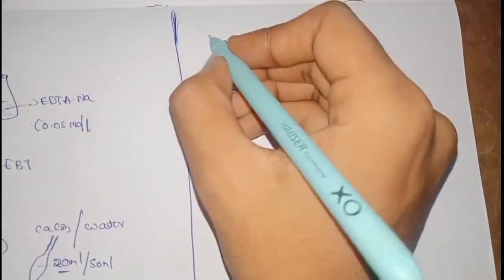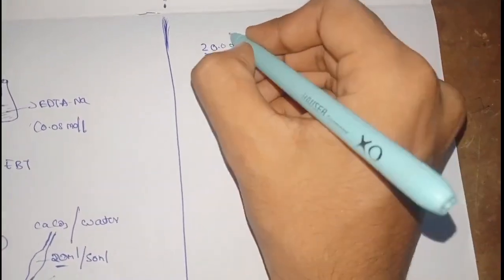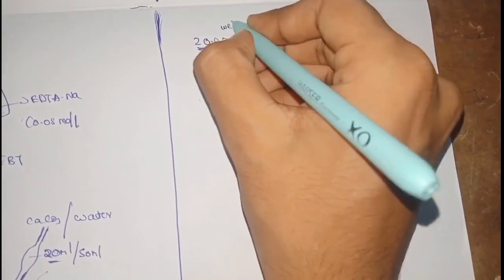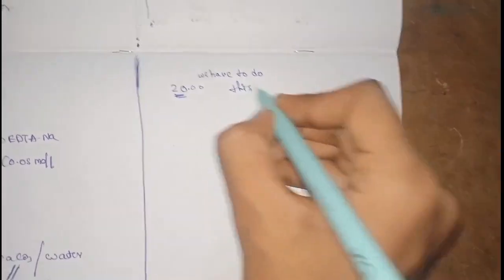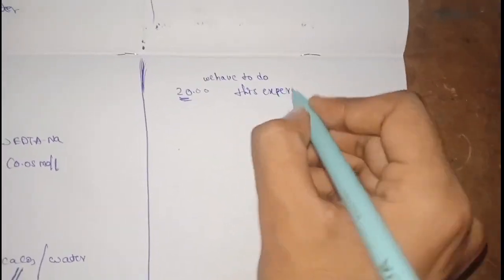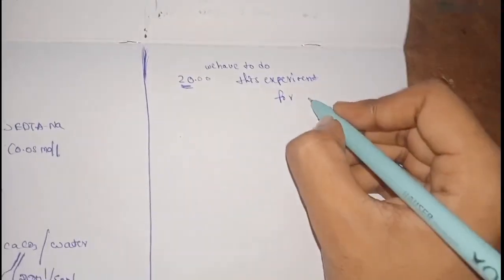We have to do this experiment 4 to 6 times.